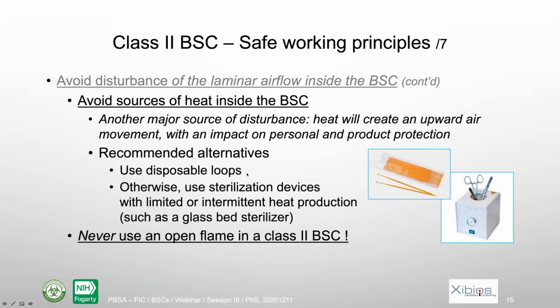If you don't have access to this, you could use some sterilization device with limited heat production, like this glass bead sterilizer here. It will only sterilize materials when you use it and only for a short time. But still, it will create some disturbance of the airflow, so it's not the best possible practice. Of course, salespeople will tend to sell you this type of sterilizer instead of loops because they will make a lot more money with it. Please don't reject the idea of using loops like this, disposable or sterilized, for instance, in the autoclave.